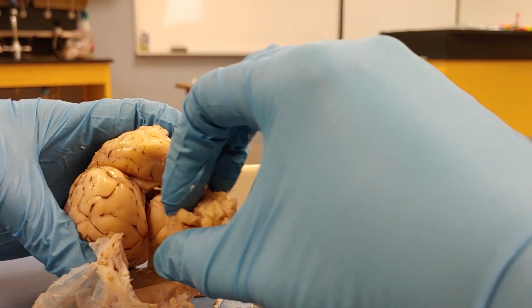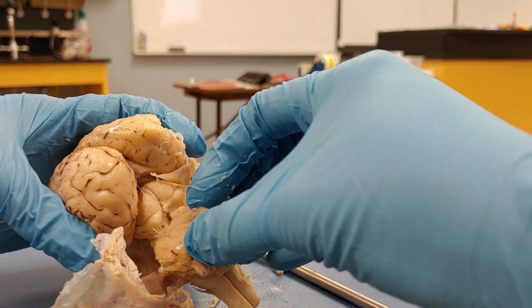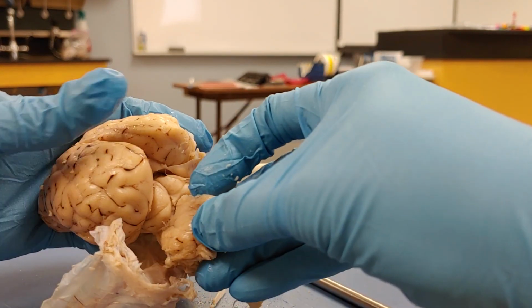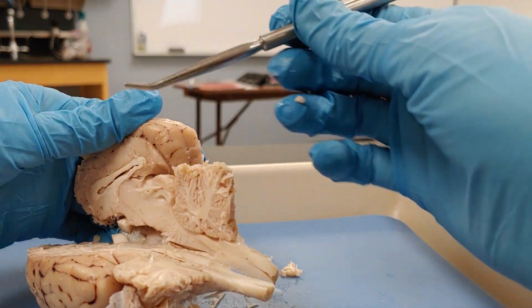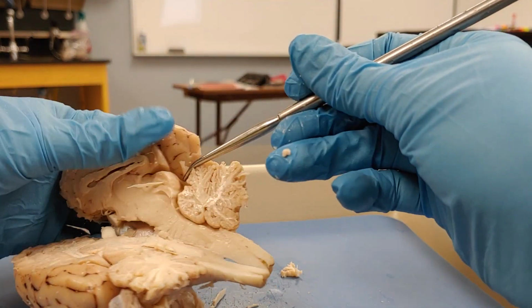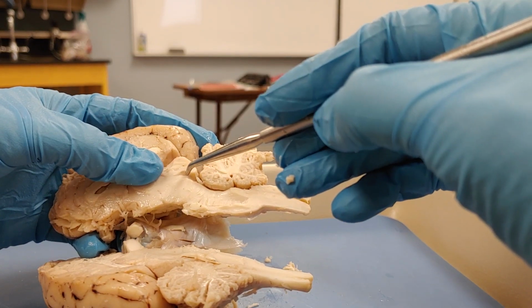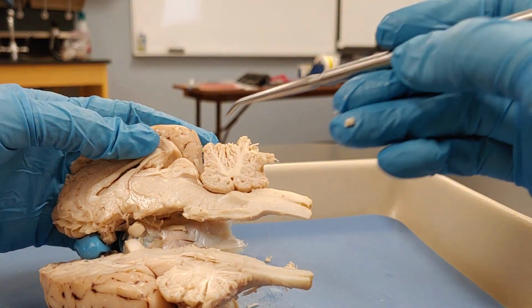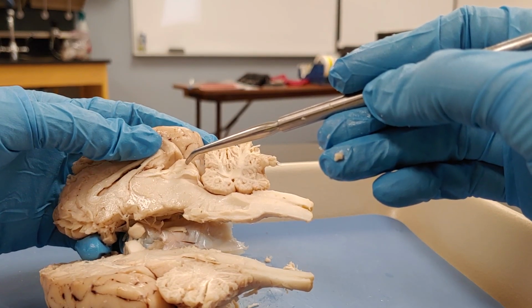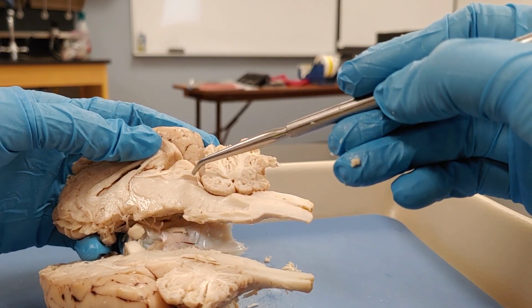So when you pull the cerebellum down, you can see those four bumps. So the top two are the superior colliculi. The bottom two are the inferior colliculi. And you can see them here as well. I'll show you this way. So superior colliculus and inferior colliculus. You can also see it from the middle. Again, superior and inferior colliculus. So right above the cerebral aqueduct. Those are the regions responsible for the visual reflex of turning the head when you see a bright light, and the auditory reflex of turning the head when you hear a loud noise.